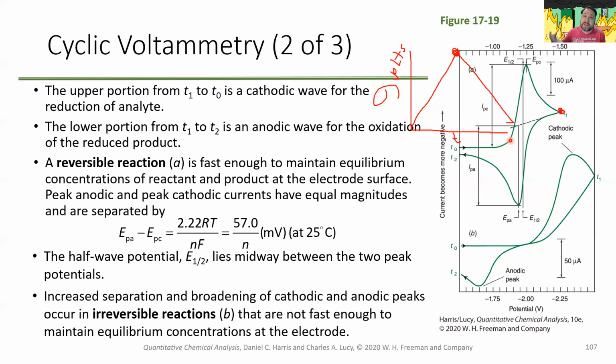When that happens, electrons hop on or off of the electrode onto our molecule. Because I'm now moving charge around, that's a measurable current, so our current starts to go up, right? And it's going to go kind of in a V equals IR kind of way, until we reach here, when we start to deplete stuff. We start to run out of material at the electrode surface. And then it's going to be like, oh, no, I've got a decrease in concentration. So the current is going to drop off until we reach this switching voltage. This here is our switching voltage. So our switching voltage here was minus 1.5 volts.